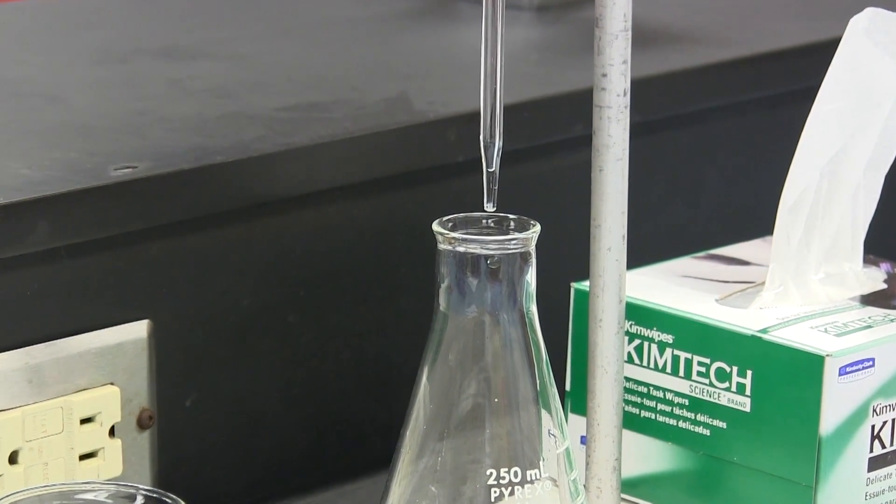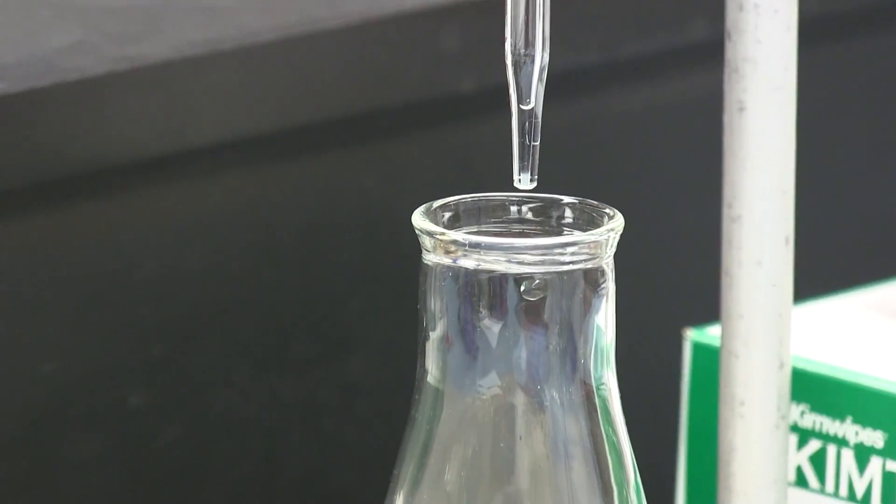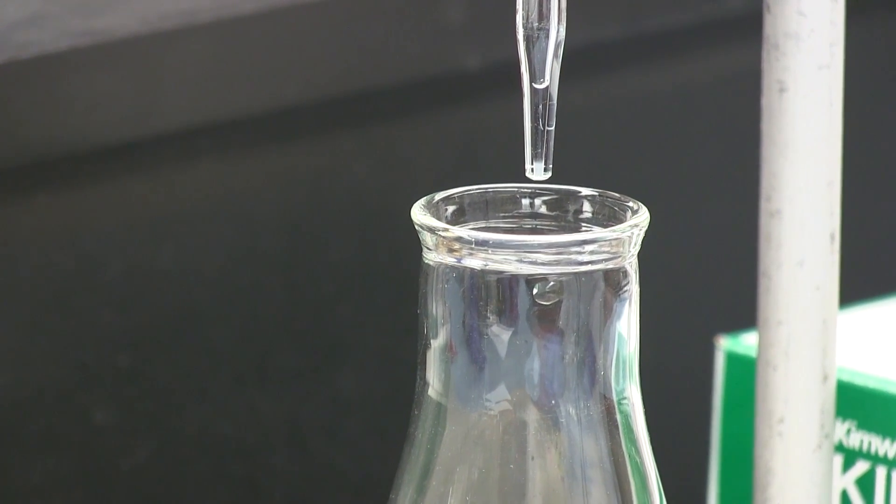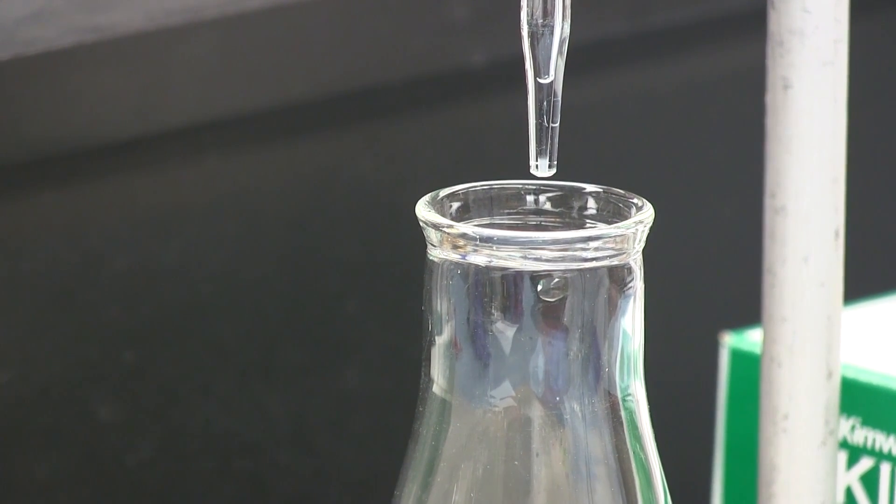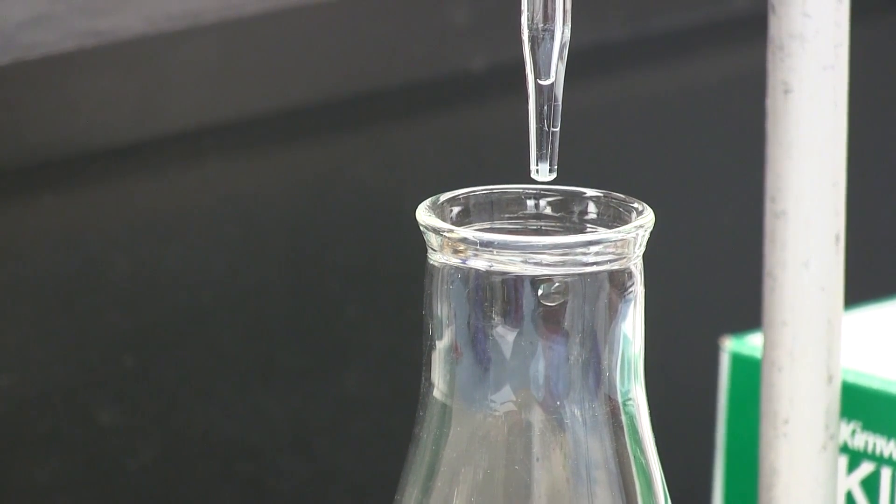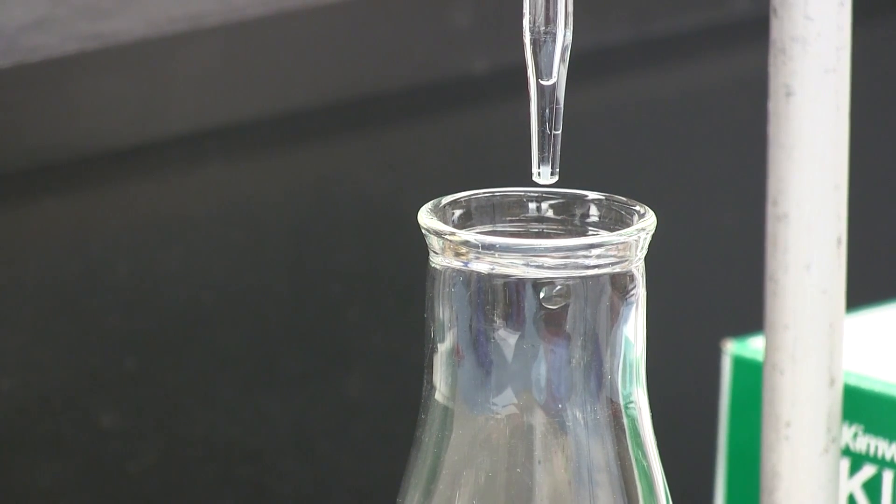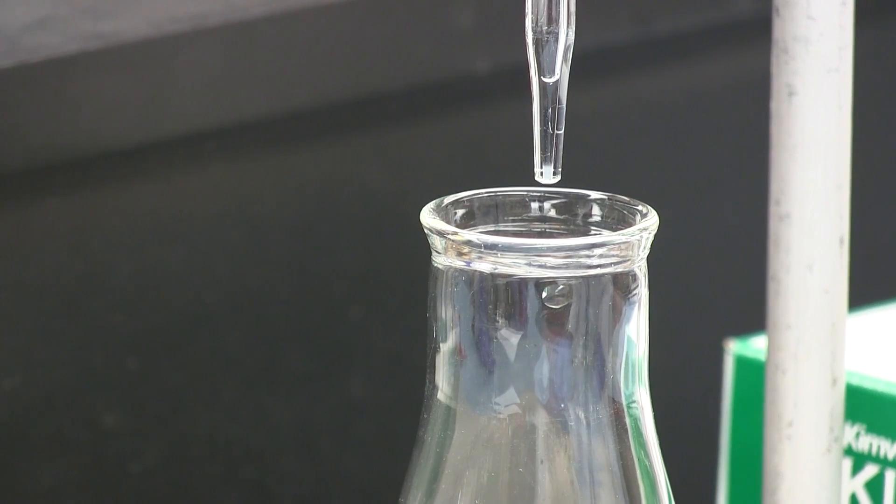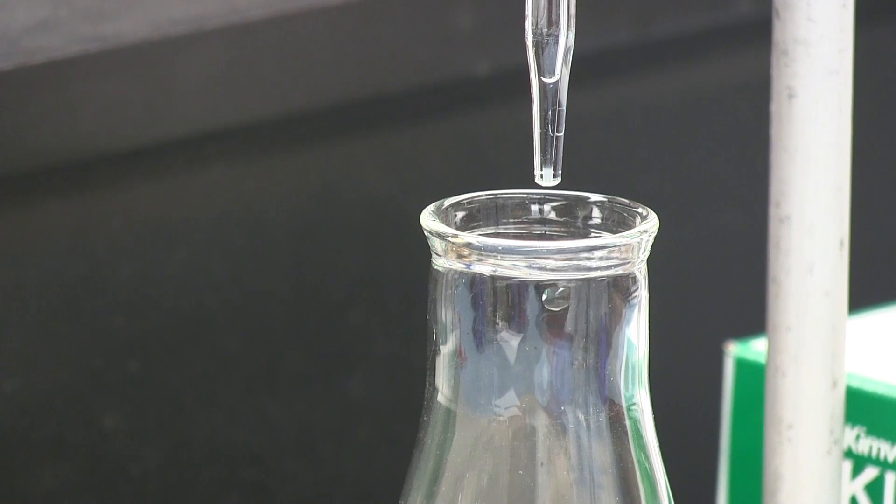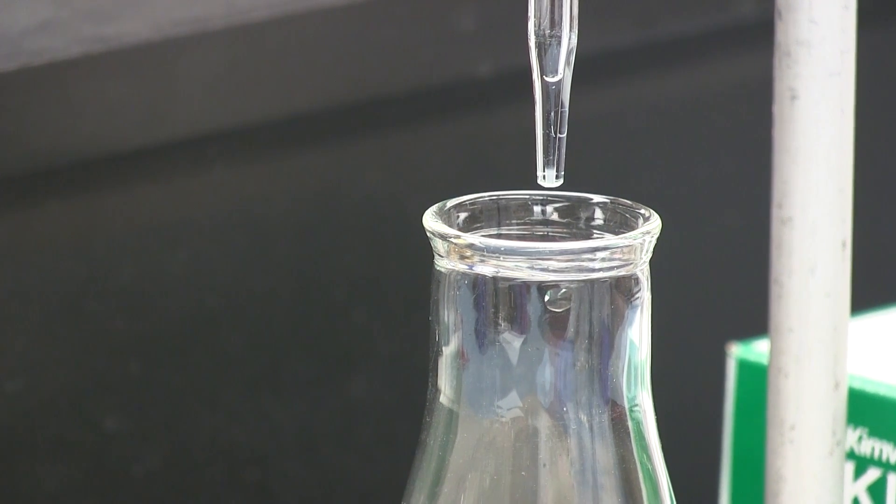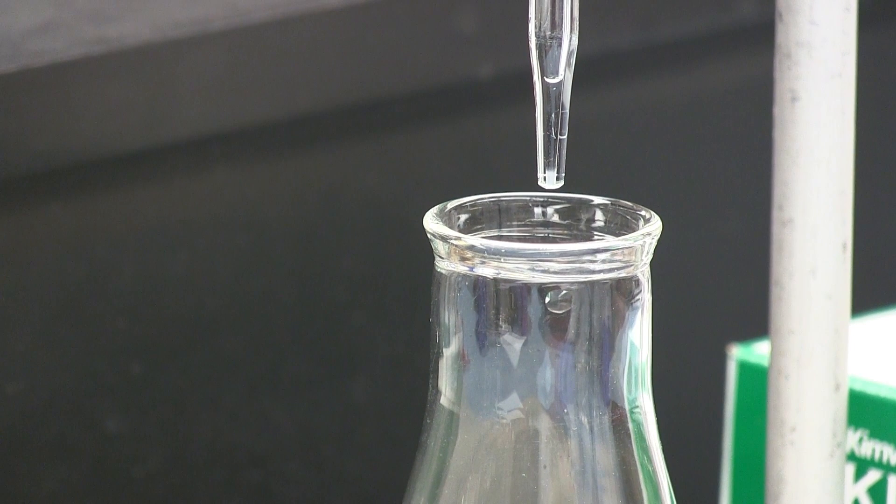If we look closely at the tip of the pipette following the transfer some liquid can be seen. Do not be tempted to blow this into the receiving vessel.